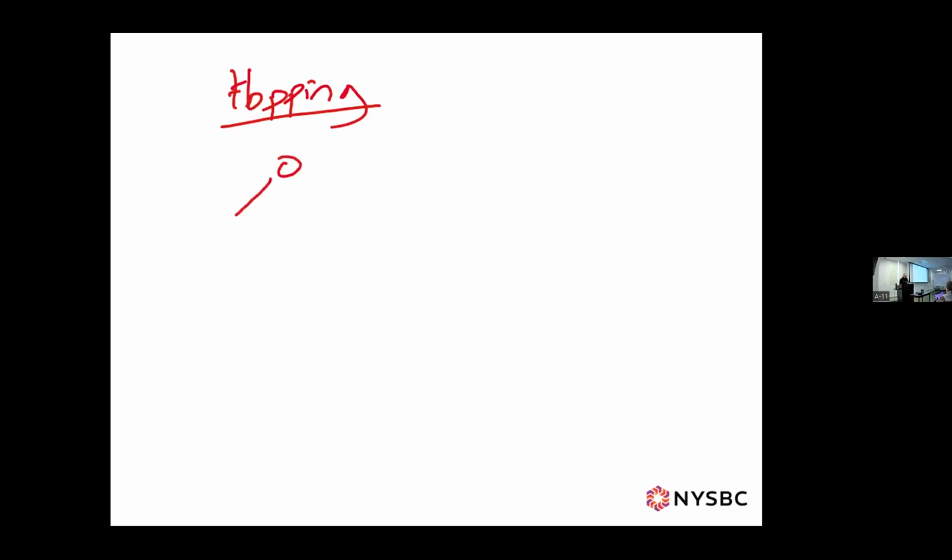So that is an exchange across this axis of the two protons that happens at a rate that I don't know off the top of my head, but it's quite fast. And then there are other motions that have been studied.